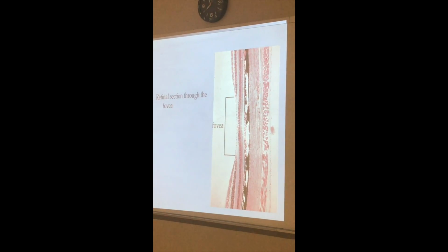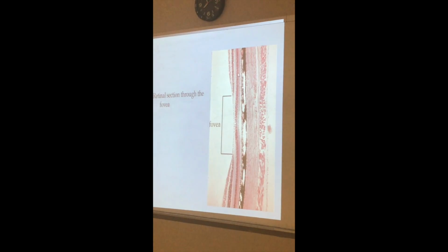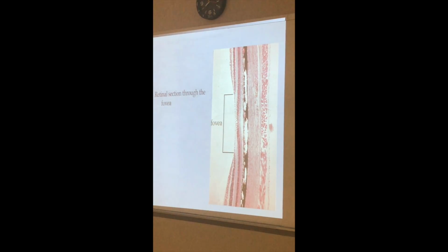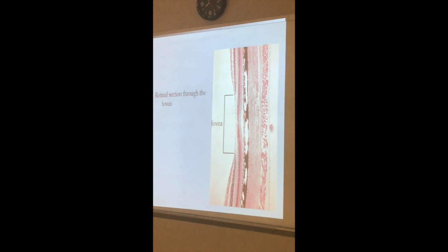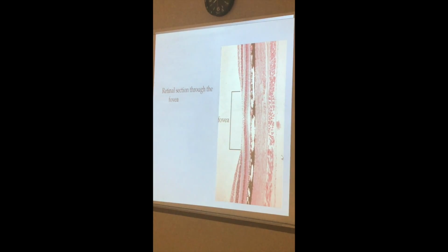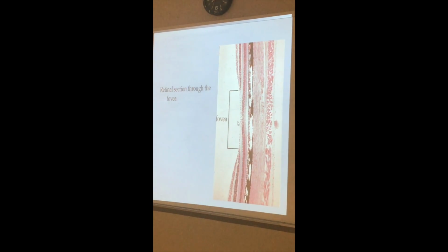What layer is this? The layer of photoreceptive nuclei, or photoreceptive layer. What layer is this? Bipolar. And what is this one? Ganglion. Let's go forward here. Here I see 1, 2, 3 layers other than the pigmented layer. Other than the pigmented layer, how many layers are there in the fovea? 2. There is no bipolar layer, it doesn't need it.